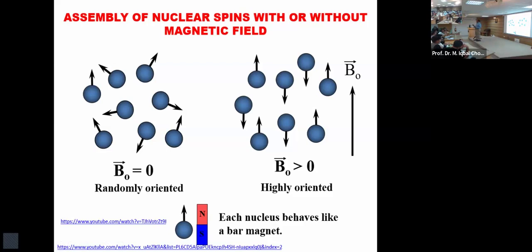You would visit the NMR laboratory and you would find that the machines, the magnets are like this, right? So the magnetic field direction is vertical. So the B naught is always up. And when B naught is up, anything which is aligning to the magnetic field is low energy state, alpha state. Anything which is opposed to the magnetic field is beta state.